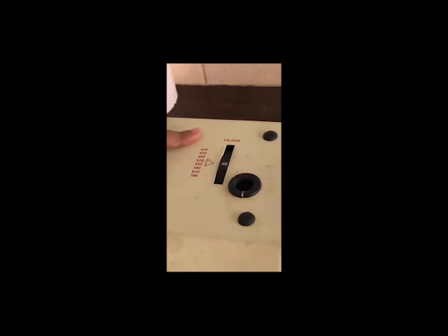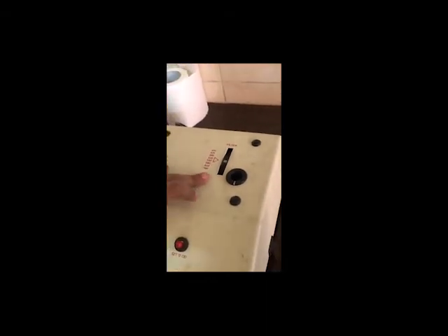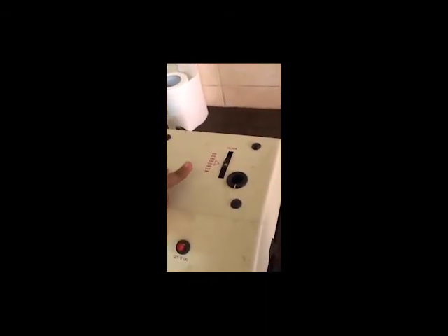Next, you can see the filters. There are 8 filters available in this colorimeter. You can see 430, 470, 490, 520, 550, 580, 610 and 700. Light from the light source hits the filter, and only the specific filter wavelength is allowed to pass. Here we choose the 490 nanometer filter. With this chosen filter, light passes through the exit towards the sample solution.